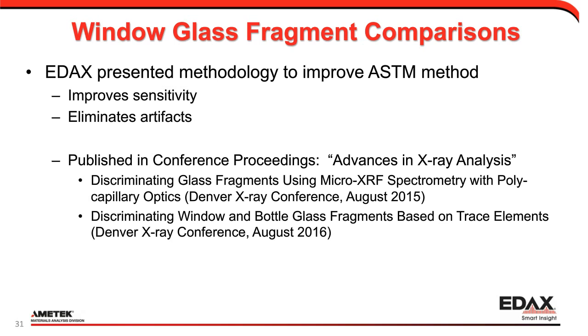So I might use, say, one filter to highlight the traces of iron or zinc or strontium and zirconium in the sample. And then I'd make another acquisition without a filter to highlight the lighter element series, the sodium, the magnesium, aluminum, that kind of thing, and combine the intensities from those two acquisitions.